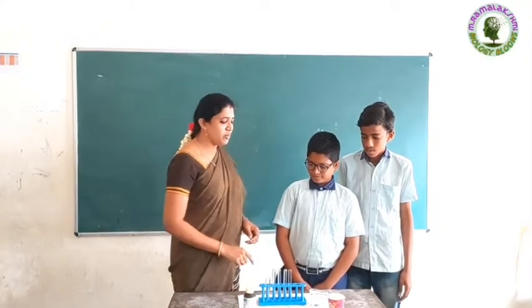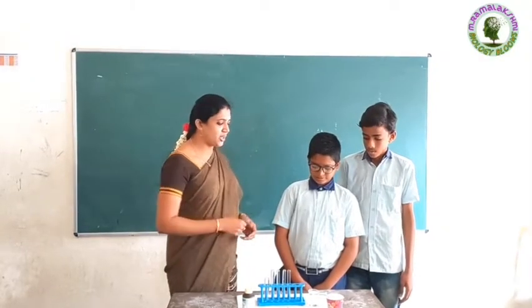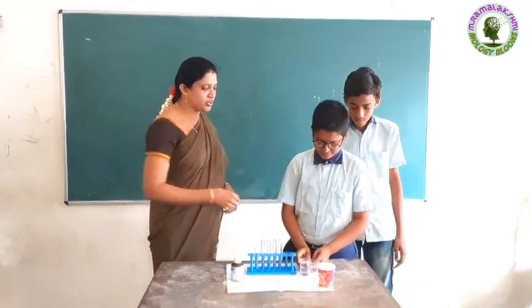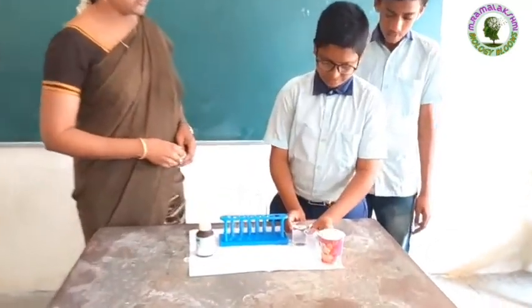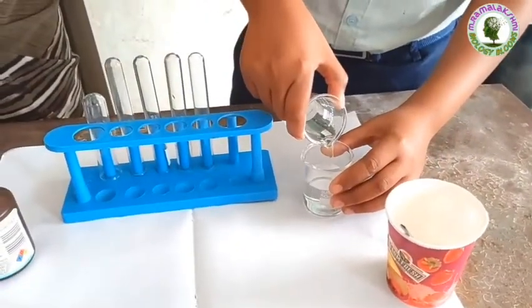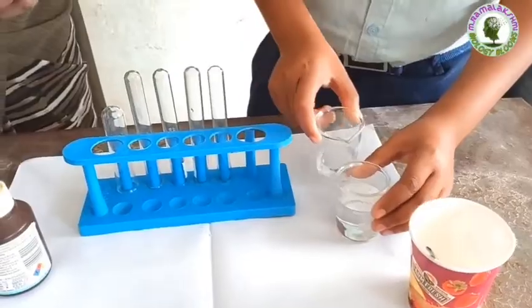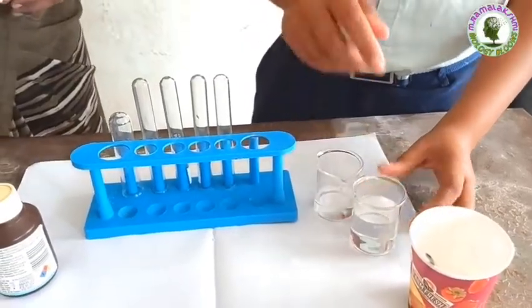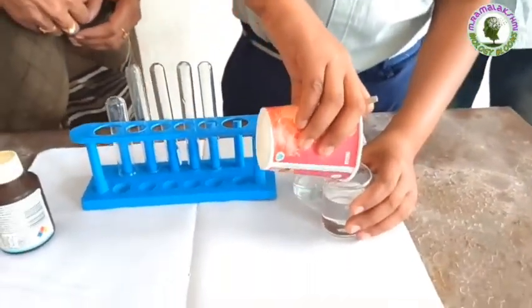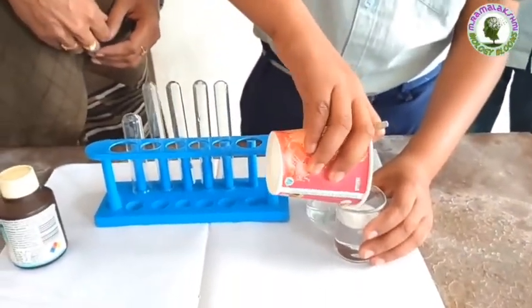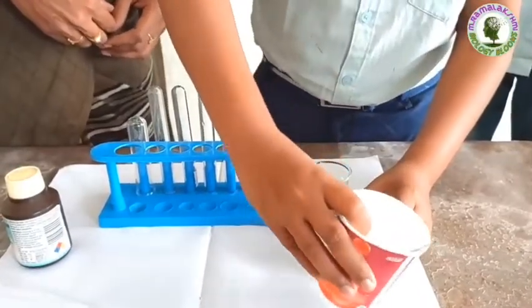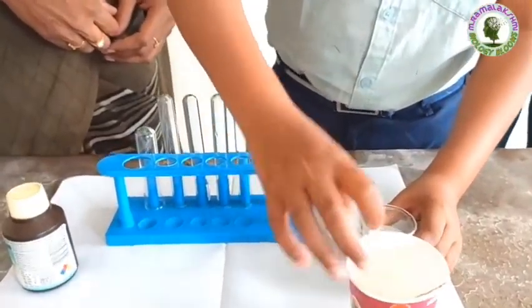So, Shyam, first make the starch solution. Take some water into the beaker, then add some rice flour into it. Stir it.